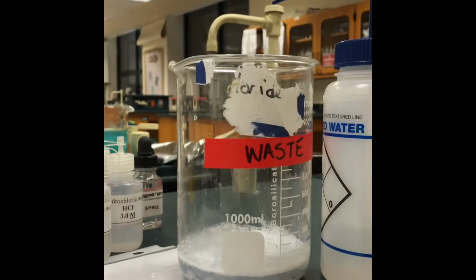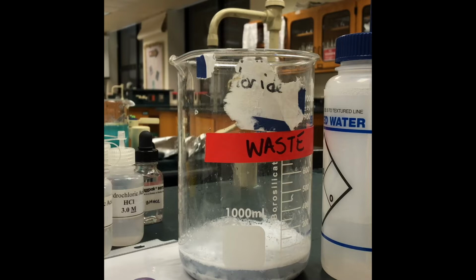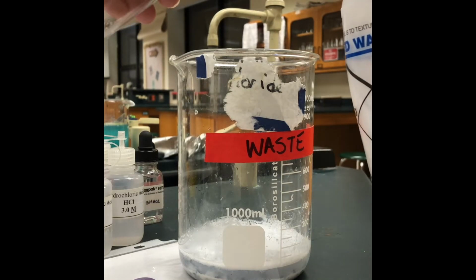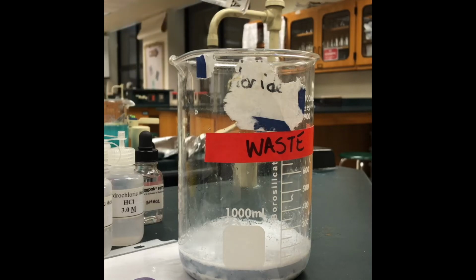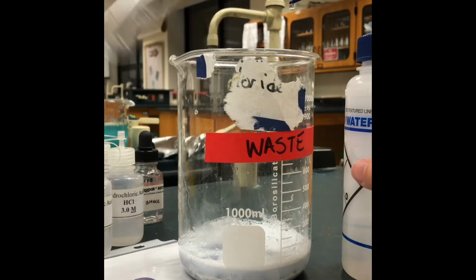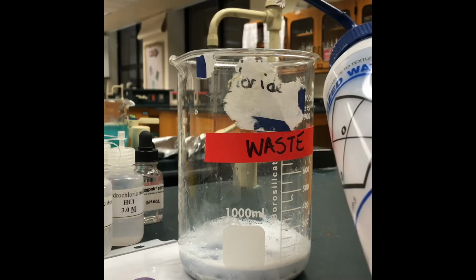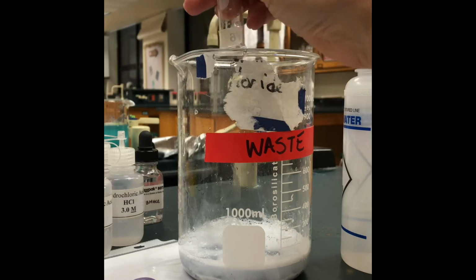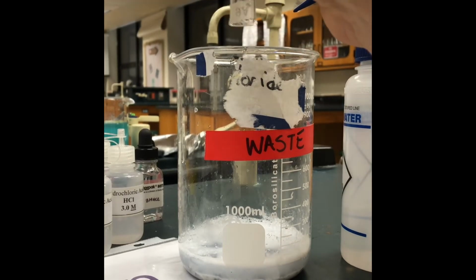You can only see Miss B's setup. All right, here we go again. Gonna put some water in here, then dislodge it, and let's see how I did. Ooh, still not good. So maybe I'm gonna hold it upside down and shoot water in at the same time and do a little clank. Getting better. There we go, yay.